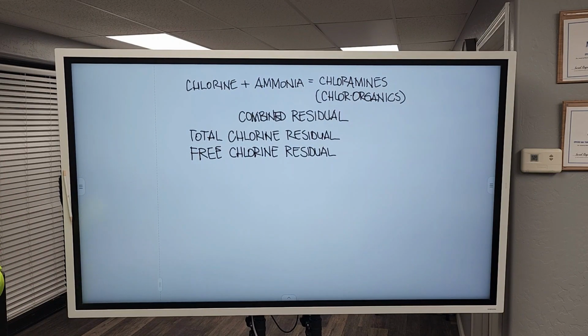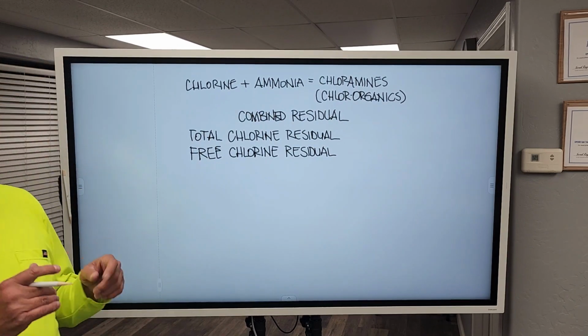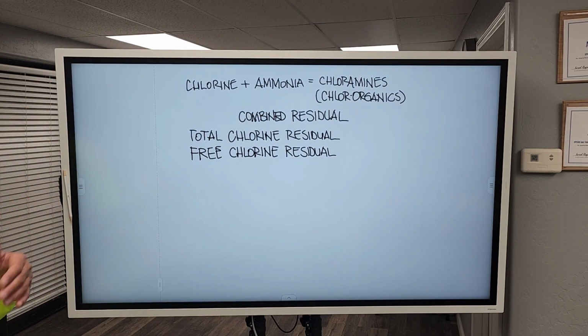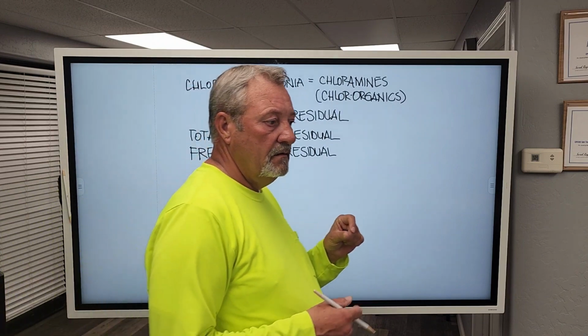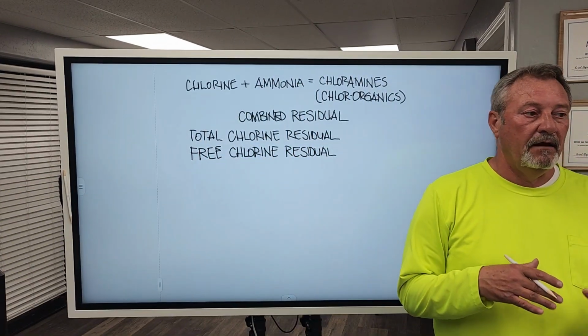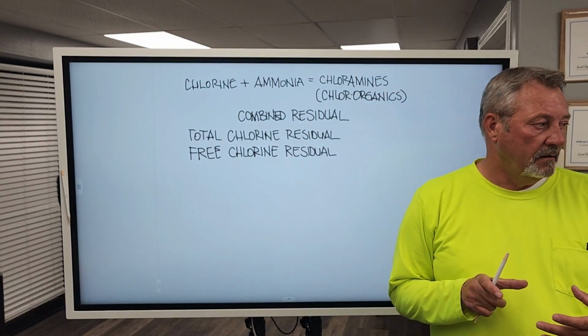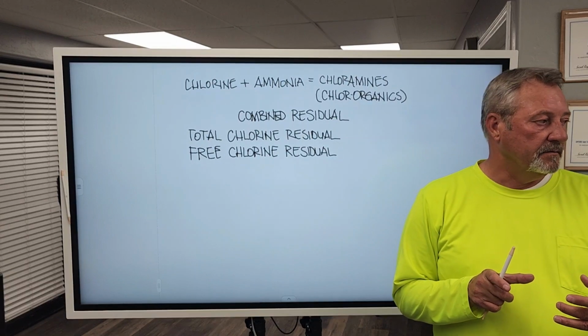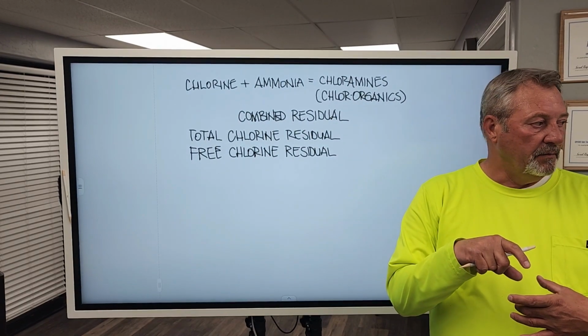Testing for chlorine residuals can be done in the lab through a titration method that gets a color, and they match it up. In the field, we have test kits. The test kits come with a little packet of reagent. They have reagent for total chlorine and reagent for free chlorine. It comes with a colorimeter, which, when we take the sample, we put it in the meter.